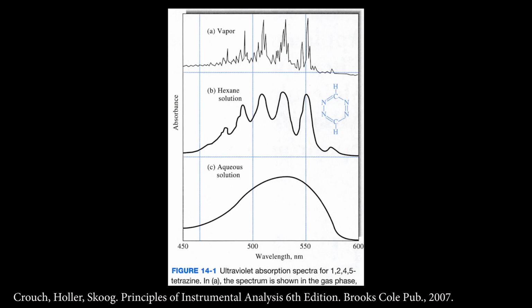That actually shifts and makes even more energy levels, even more small vibrational, you end up with these rotational energy levels, they're called, and they shift because of the intermolecular forces, and you end up with so many of those transitions, so many of those little lines, that the instrument just doesn't have the resolution to distinguish all these, thousands and thousands of lines, and it just starts to appear like a big blob. So this is the issue with UV-vis spectra, the peaks are just big blobs centered around a maximum, and we do use that maximum for identification purposes, but it's pretty weak as an identifier.